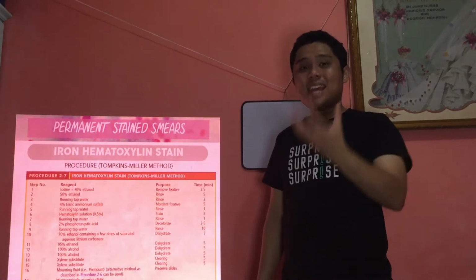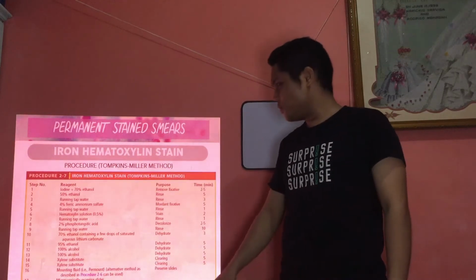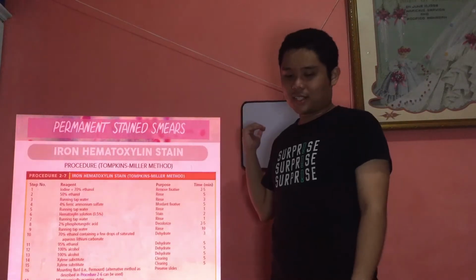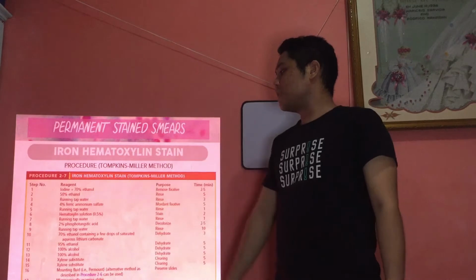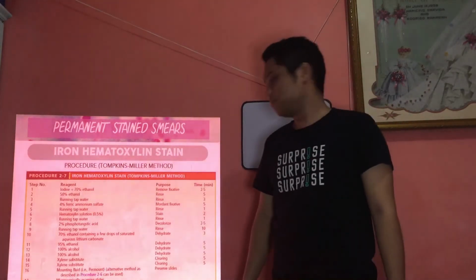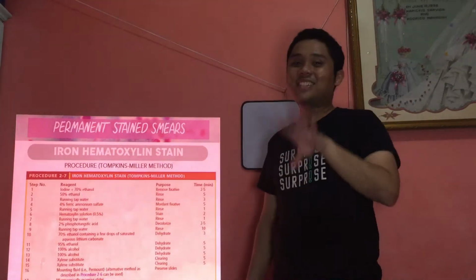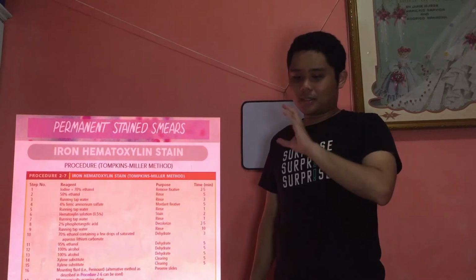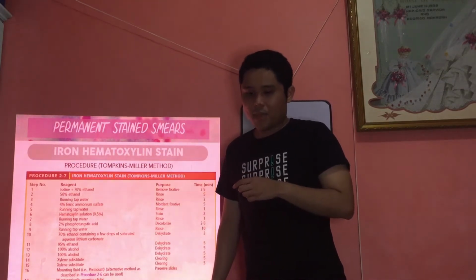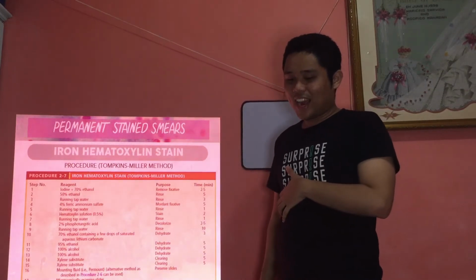As you can see, may na-add. You added 4% ferric ammonium sulfate, which is for mordant, which again I will discuss later. And also 2% phosphotungstic acid, which serves as a decolorizer. Tama, decolorizer. Yeah, decolorizer. Okay. Alright, ayan. So, later, I'll discuss this in acid fast. Mas applicable siya sa acid fast. Okay, alright.